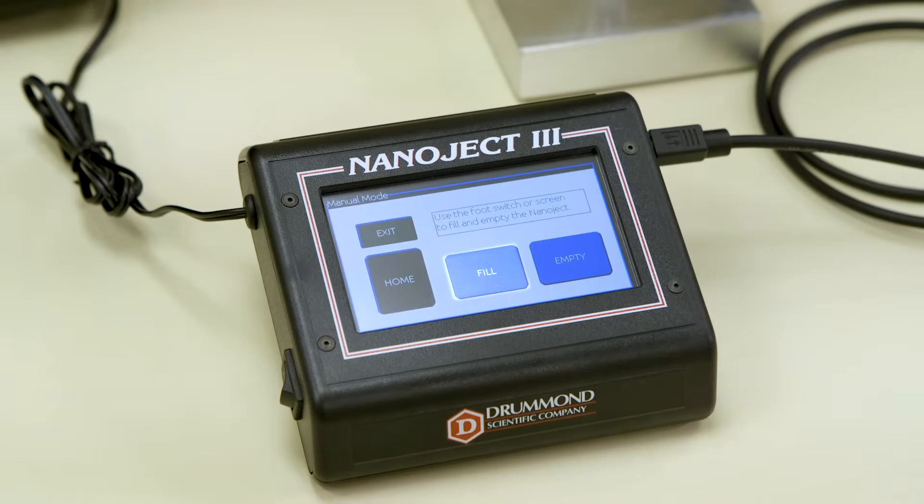In Manual mode, you will find options to home the device, fill, and empty. The fill and inject speeds can be set in the Setup menu.